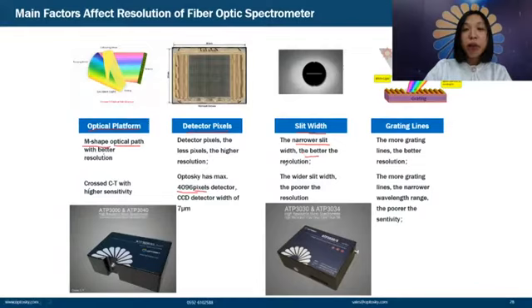And there are grating lines: the more grating lines, the better the resolution. All these four factors can be selected to improve the resolution.